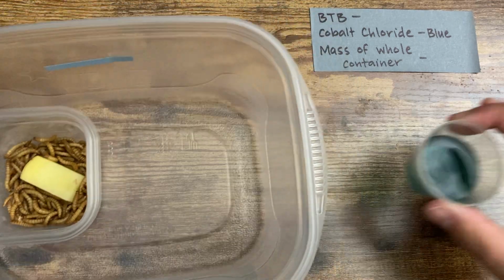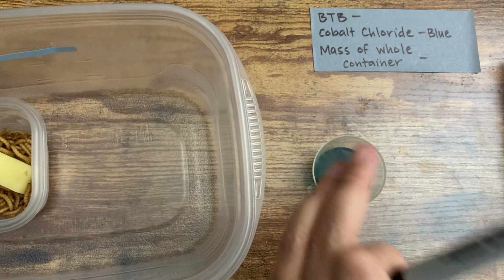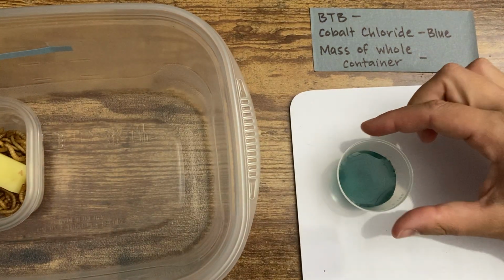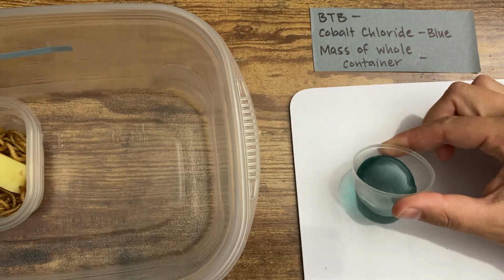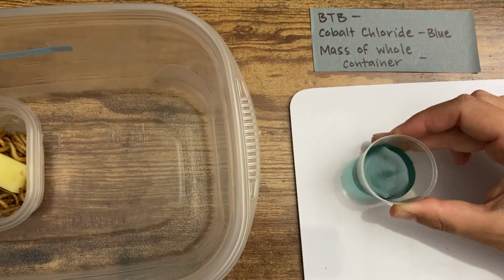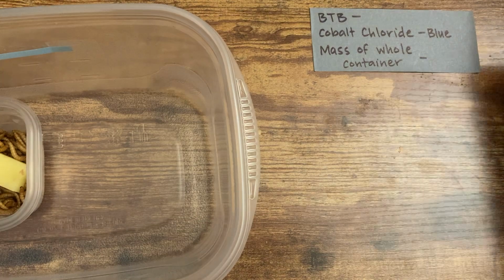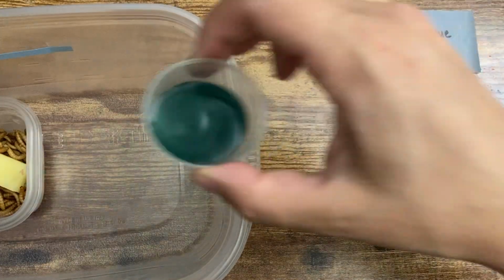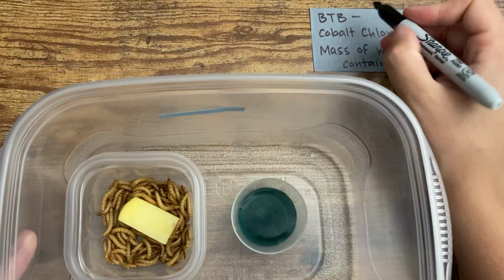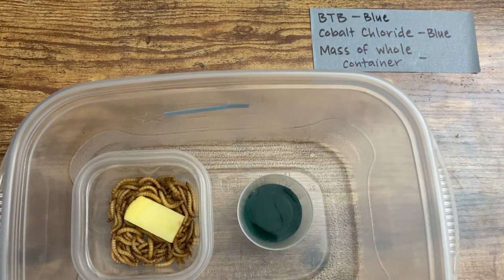Now, the next thing I'm gonna add is my BTB. And it's kind of hard to tell what color my BTB is until I put it on this white surface. And even then, you kind of have to tilt it a little bit to see that it's mostly blue. It's got like a hint of green to it, but I'm gonna say that the starting color of this is blue. It's definitely more blue than yellow. So I'm gonna add that, and the starting color of my BTB is blue.